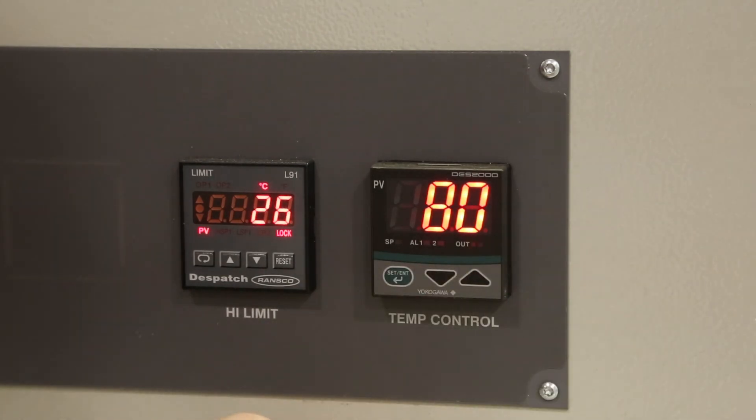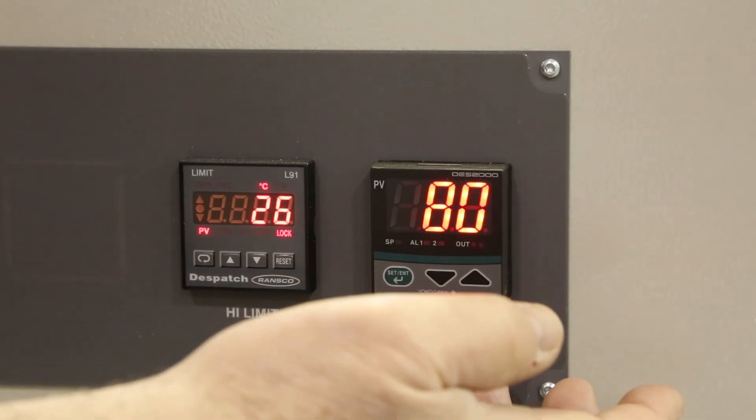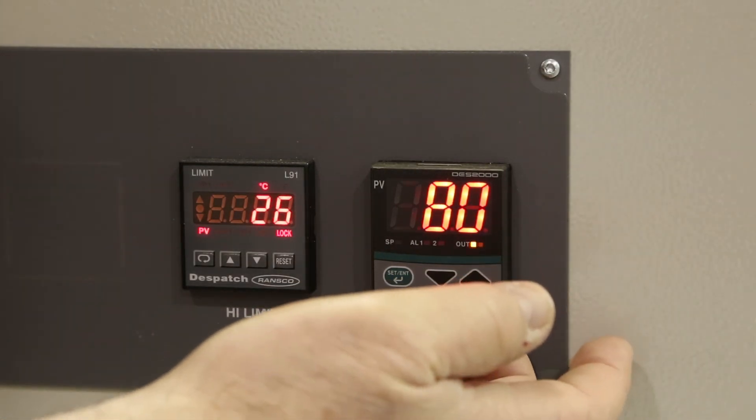At this point you need to check the configuration settings in the oven, because once you change from centigrade to Fahrenheit or from Fahrenheit to centigrade, it changes all of the configuration values within the oven.